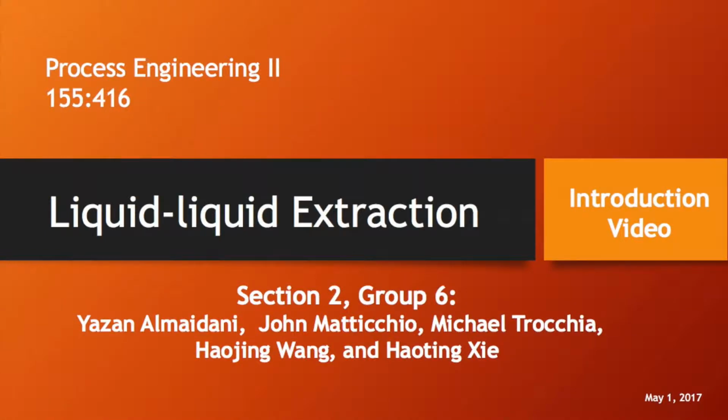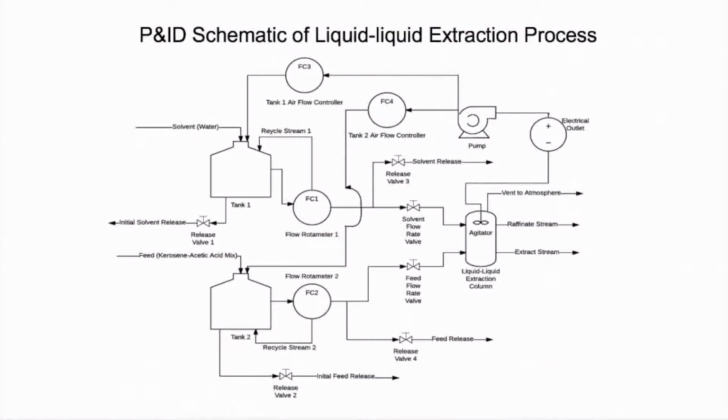Everybody, this is our liquid-liquid extraction experiment. Through the extraction column, the goal is to purify the desired species, kerosene, the raffinate, from the undesired species, acetic acid, the solute, via a solvent extraction with water.